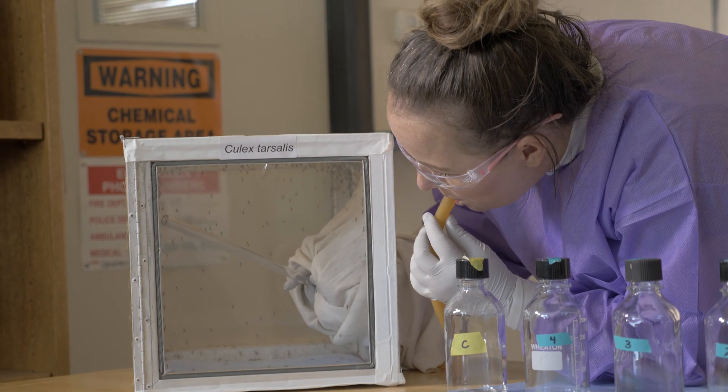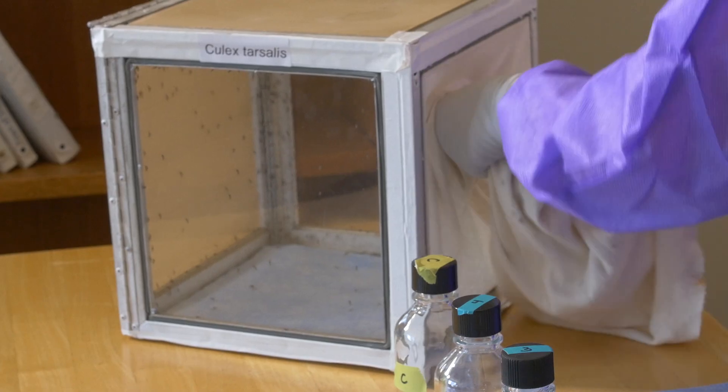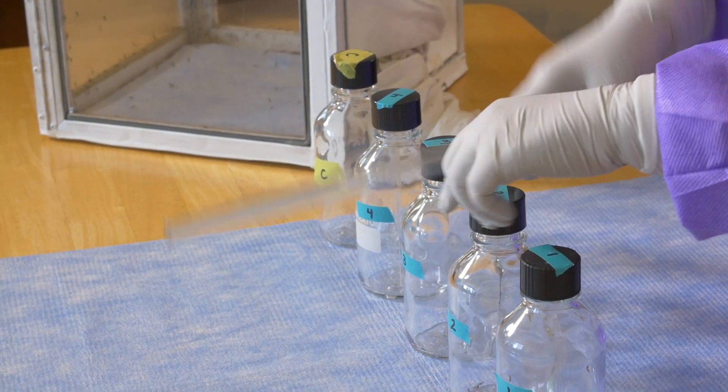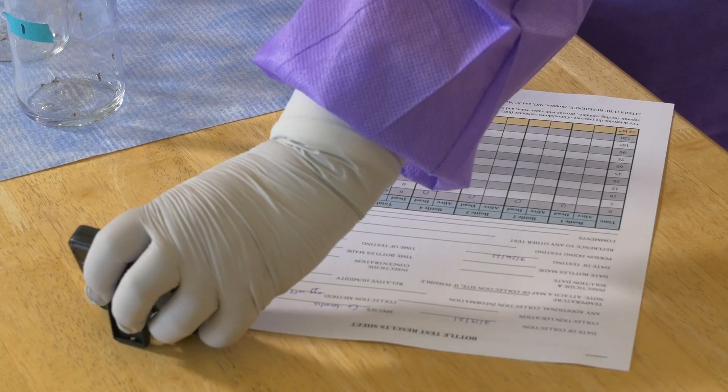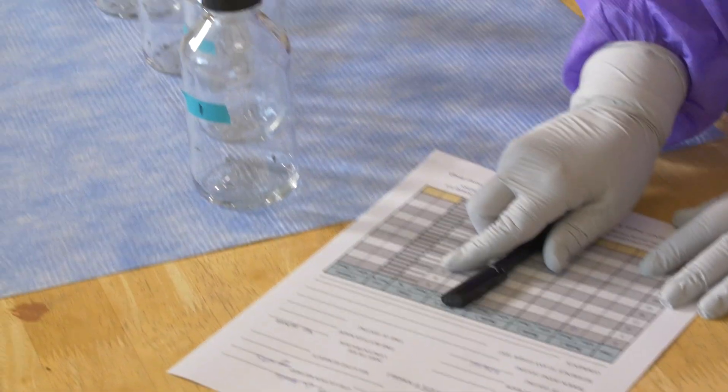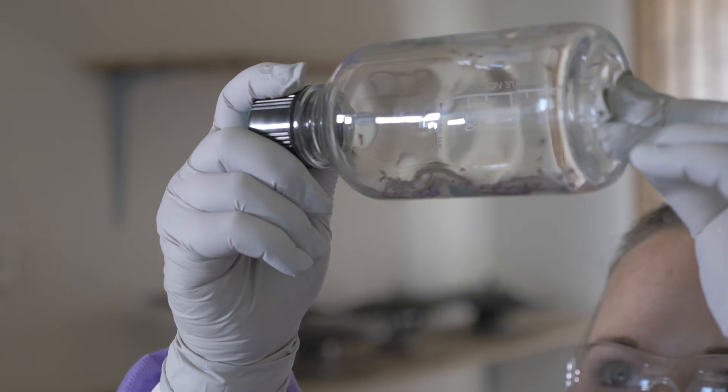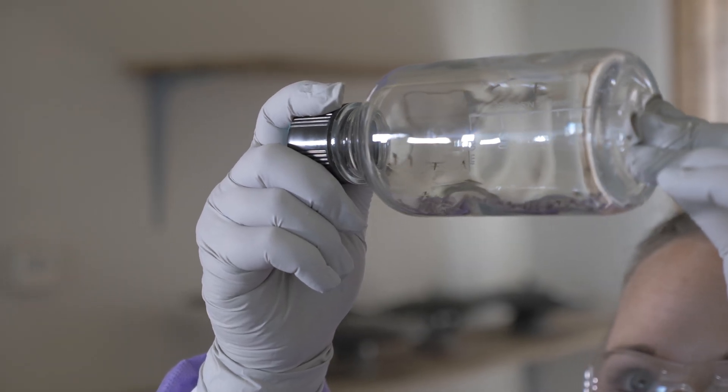Mosquitoes are then put into the bottle and observed for two hours. At selected time points during those two hours, the number of dead mosquitoes are counted. The test should be run for the entire two hours, unless all mosquitoes have died before the two hours has ended.